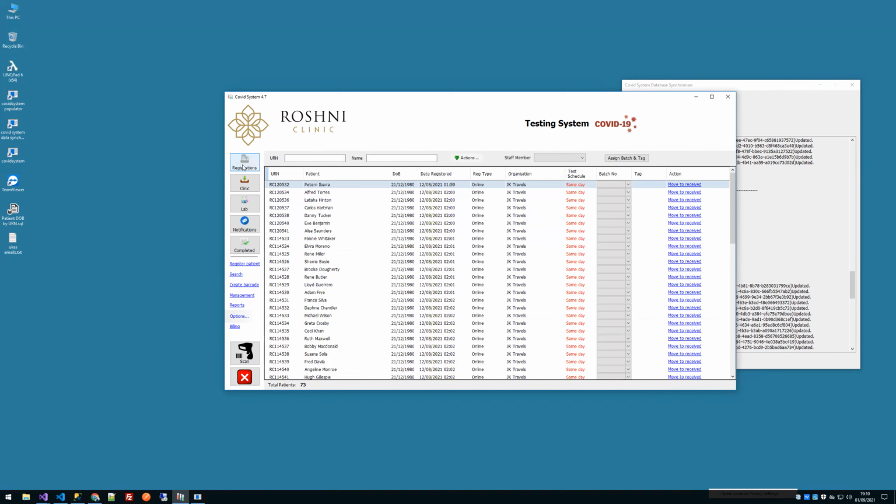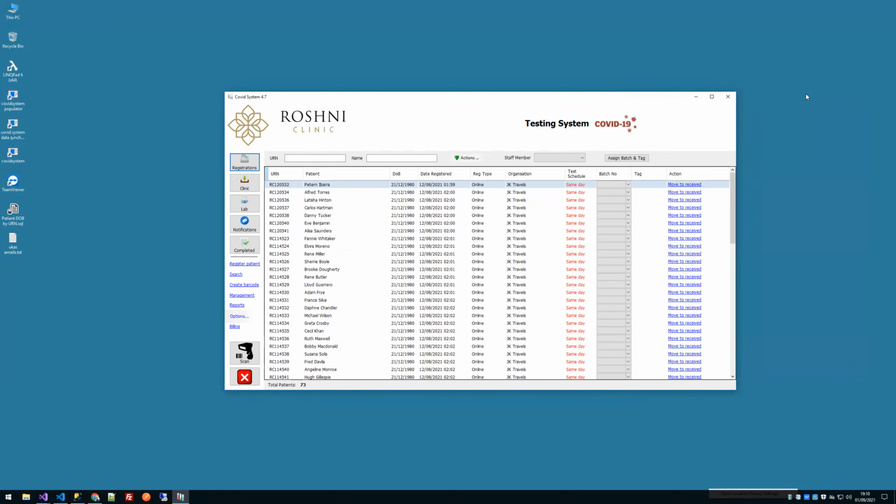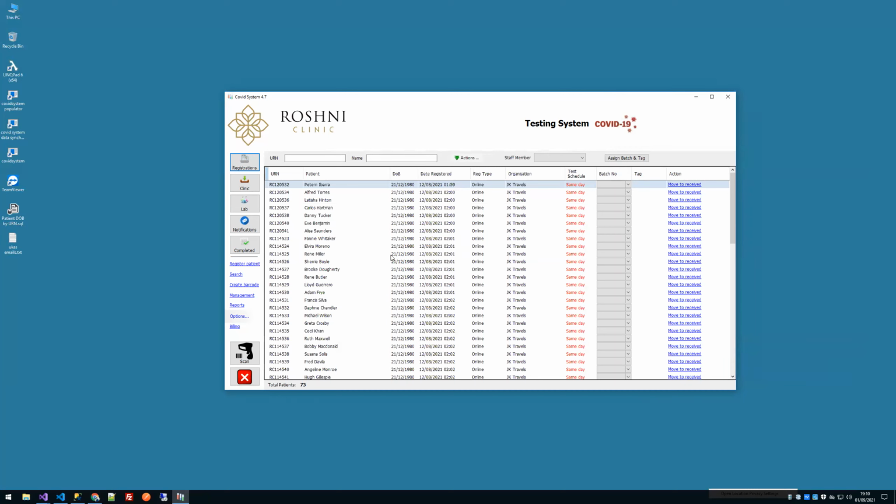Now, you might be repeating a little bit, but I'm just trying to get it all straight in my head. That's fine. So the person is going to purchase the test on our website, right? That's right. And the information is uploaded via API to your LIMS system. Then they're going to get a kit. Now they're going to have to register their kit. Where does that happen?